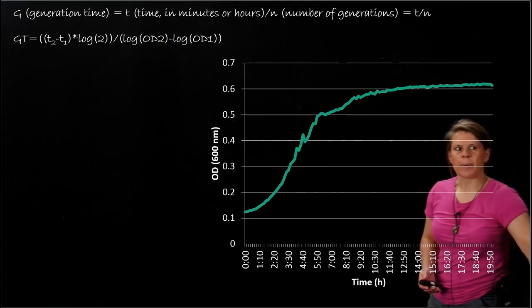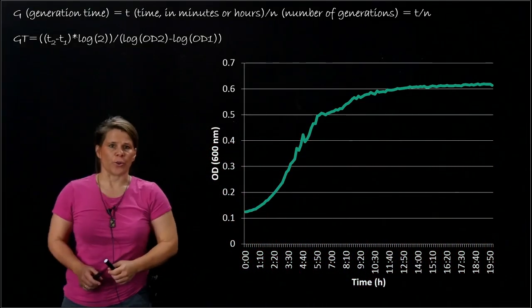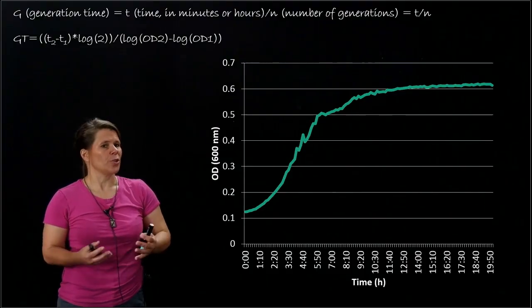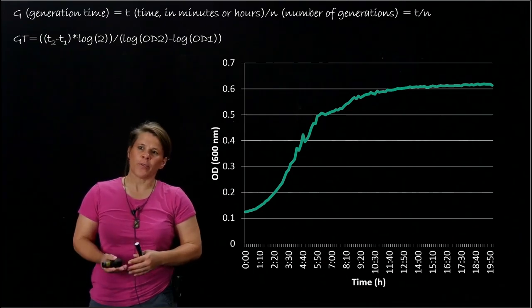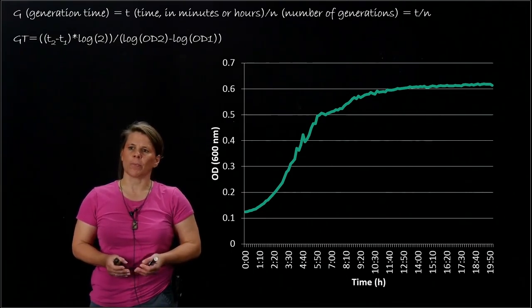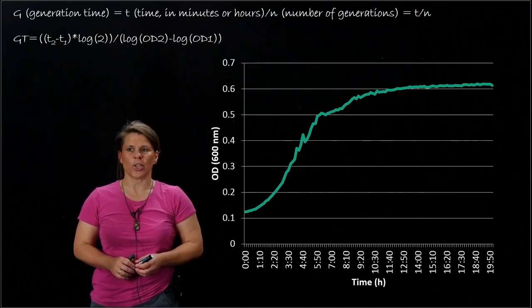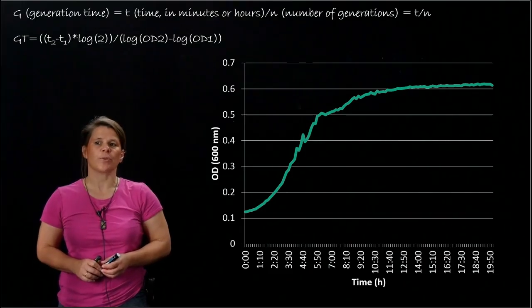So an important experiment in microbiology is a growth curve. A growth curve with microbes is something where you start microbes at a low concentration and you're observing it over time. You determine how many organisms or what the optical density is during that time, and then see how steep the slope is. The slope gives you an indication of how fast the organism grows.